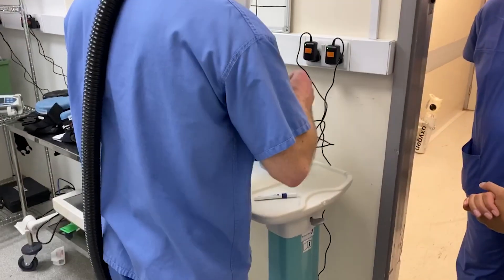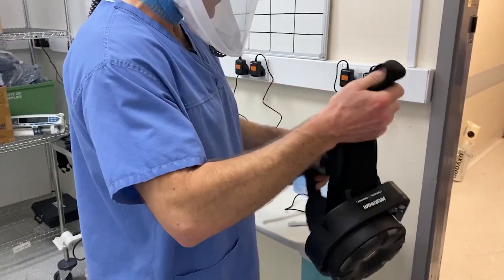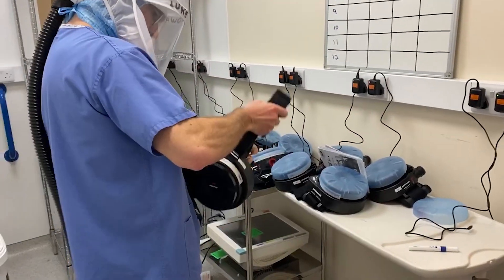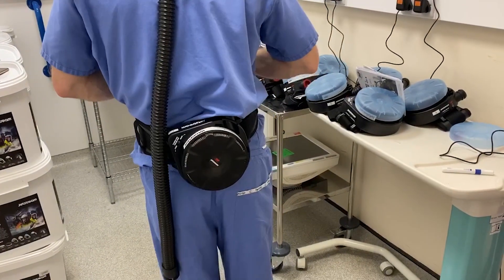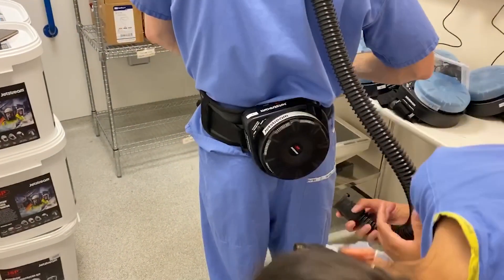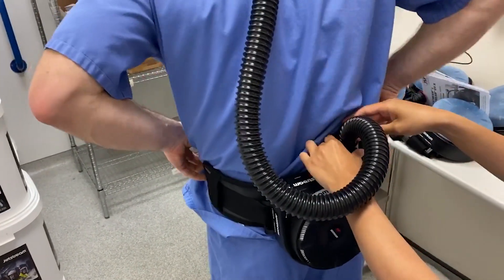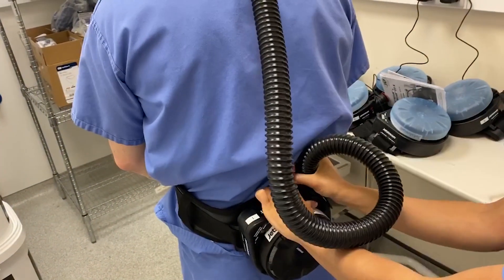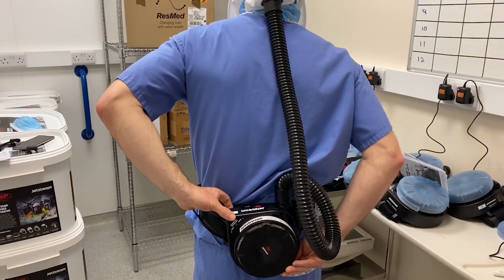Next, we will take the belt and this goes around the back. And then if you can connect up for me. Is that just a push connection? It's a push and twist. So that seems fairly secure.